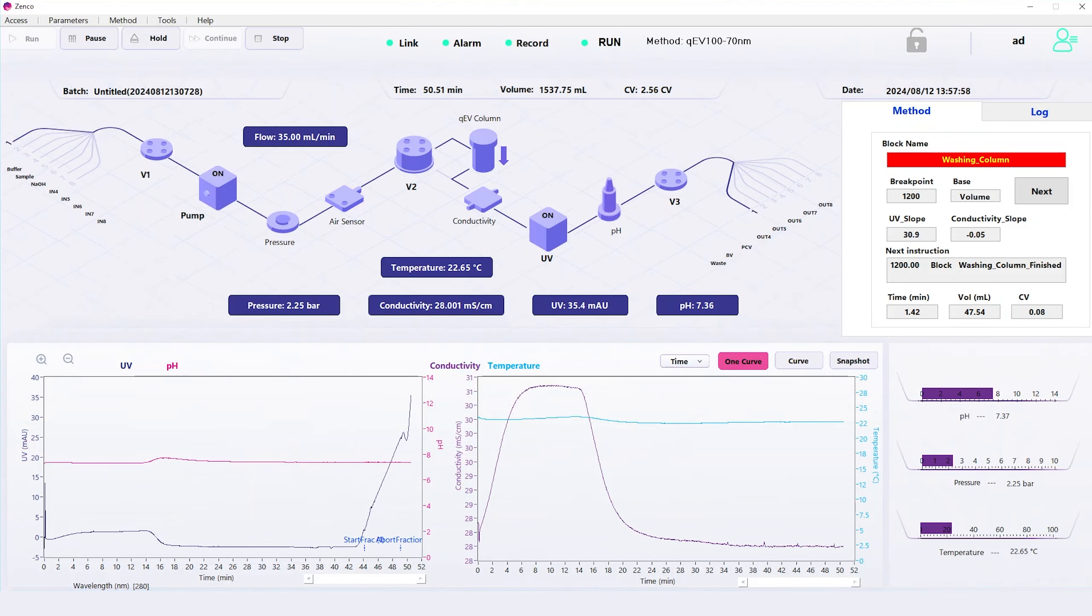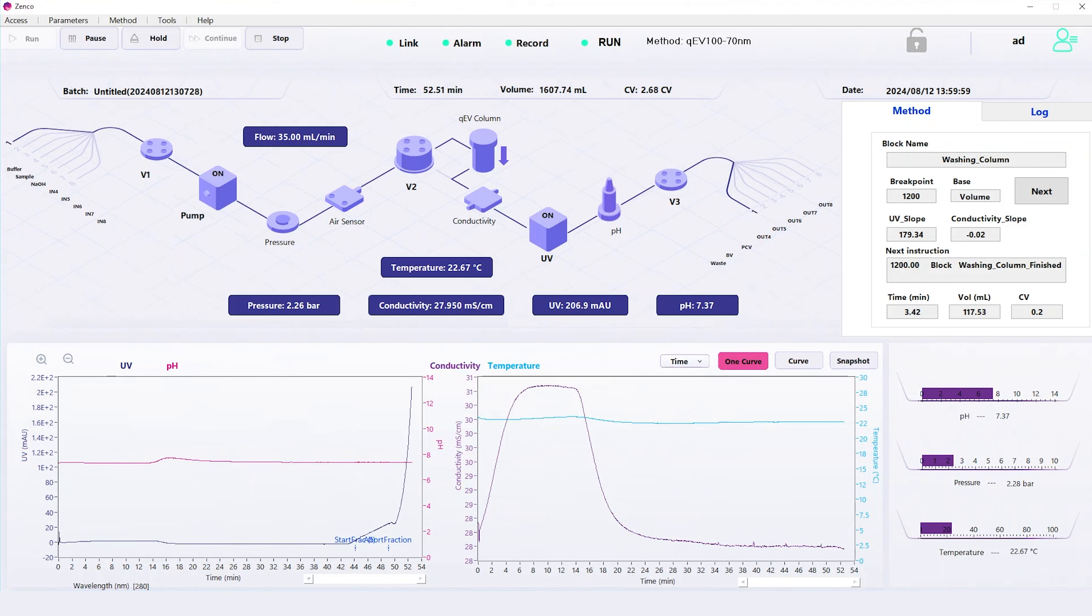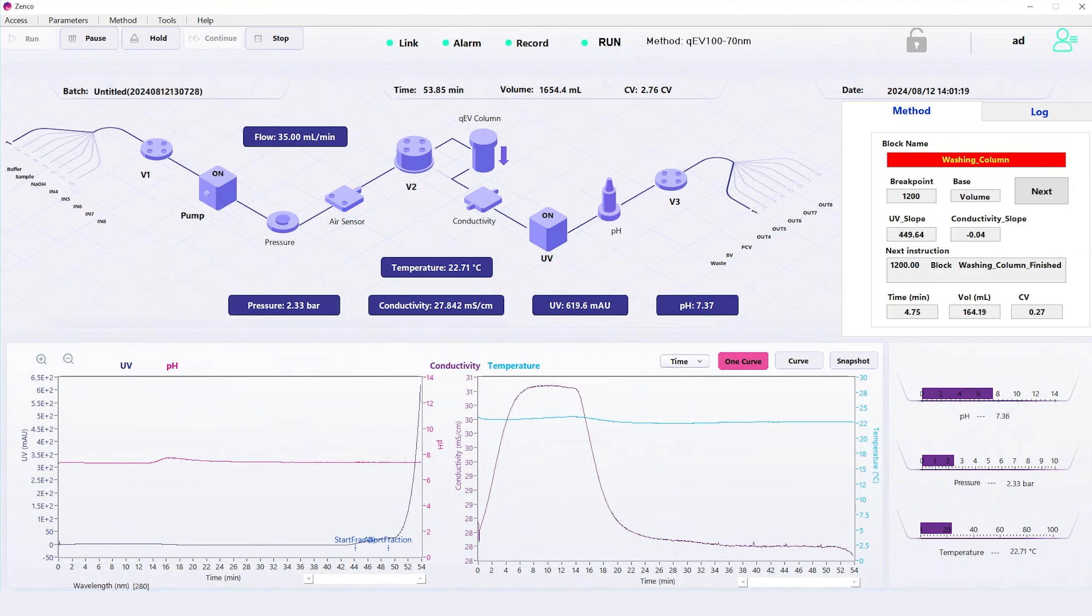You will notice there is a dramatic increase in the UV reading, indicating the proteins separated from the sample.